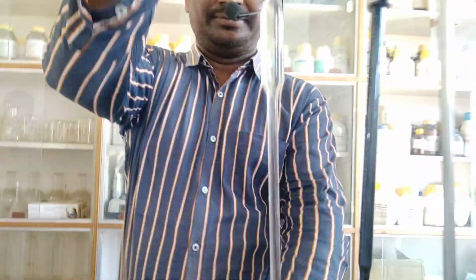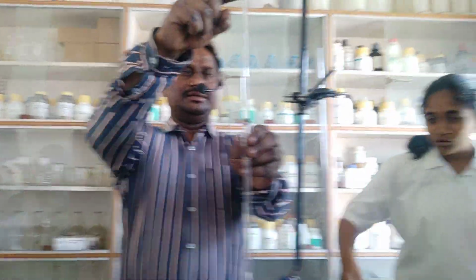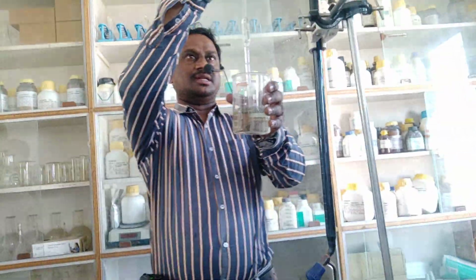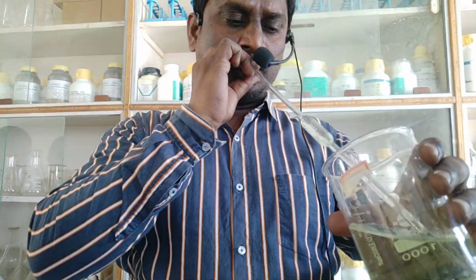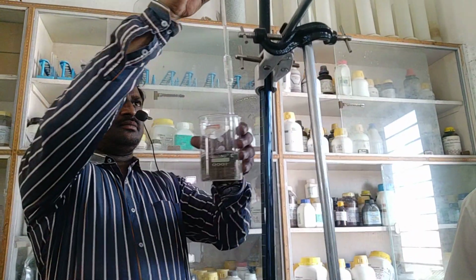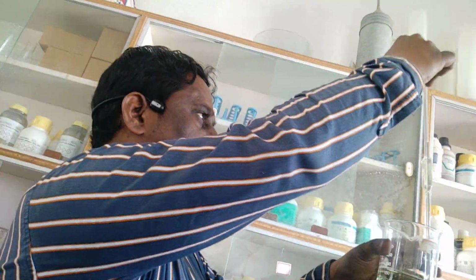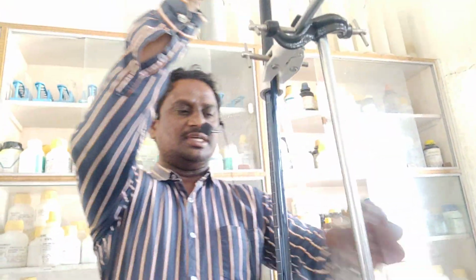So now look at here. What I told you, the index finger I have kept up here. Are you understanding? Up to the mark only should take. Just to see, it came down below the marker, so again I am sucking. Exactly the mark is there, no? Yes. So now exactly how much am I transferring?